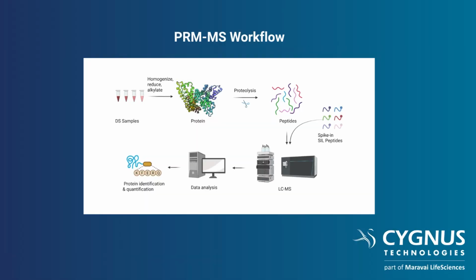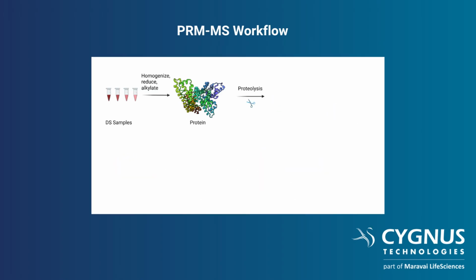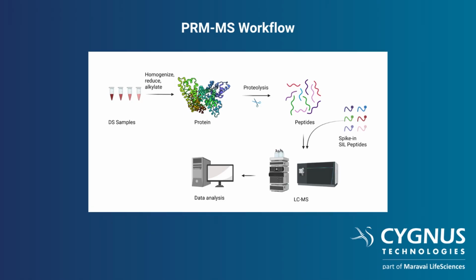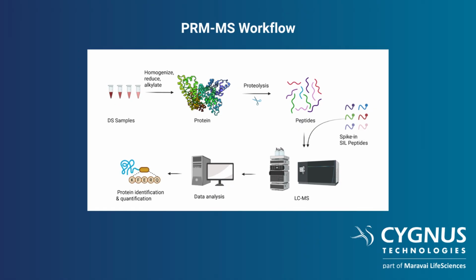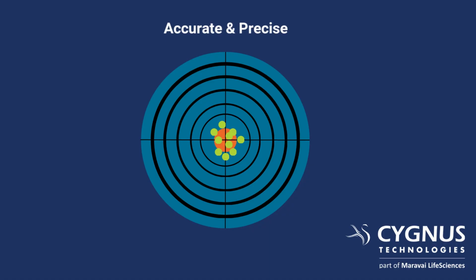And finally, how it gets exact numbers? Absolute quantification. It adds known amounts of special heavy peptides, stable labeled ones, into the sample. These are like a perfect measuring stick. Comparing the sample peptides to these standards lets the assay measure down to 0.03 parts per million for some lipases. That's the precision needed to really gauge stability risk.